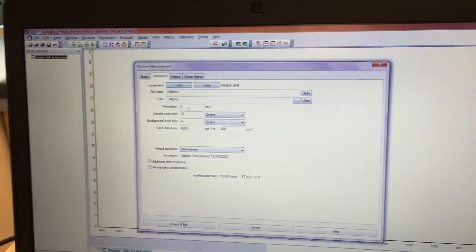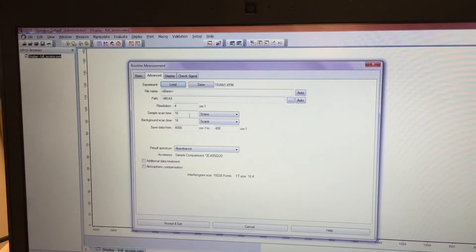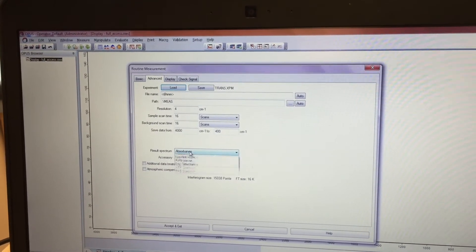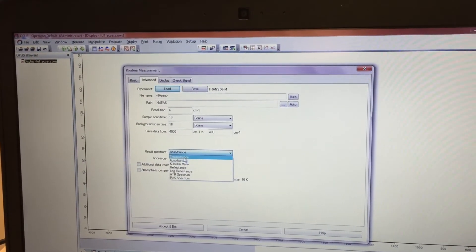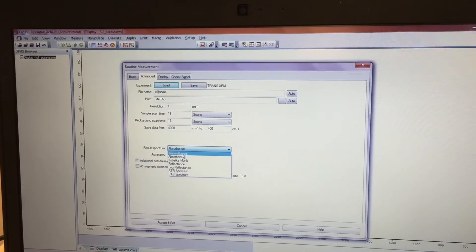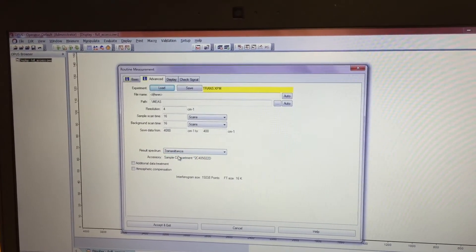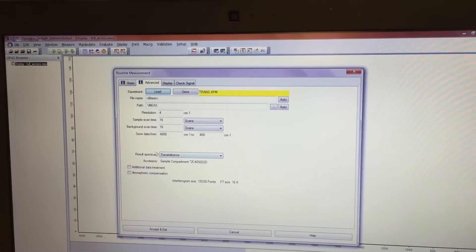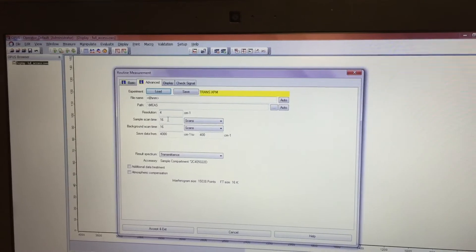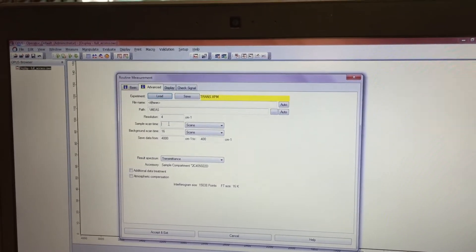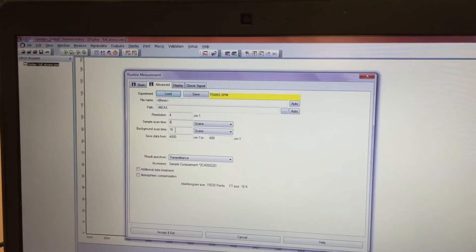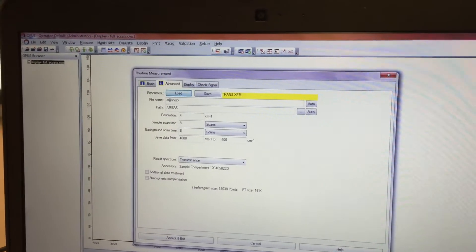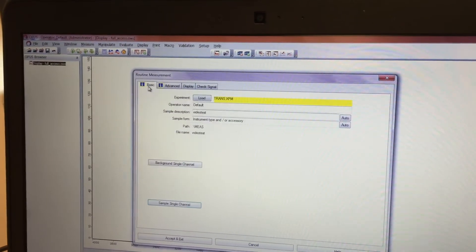Now go to advanced, where you can change the resolution, the scan time. You can change whether your result inspector will be recorded in absorbance or transmittance. Let's choose transmittance for today. Resolution we'll leave at 4. Let's make this maybe 8 scans. So the sample scan and the background scan, it's going to be 8 scans.